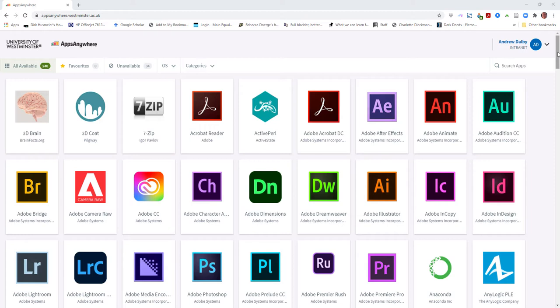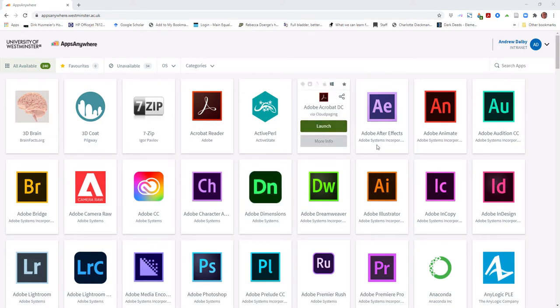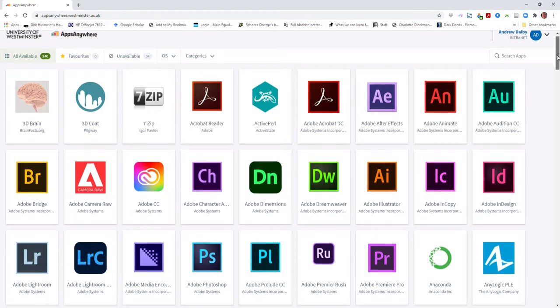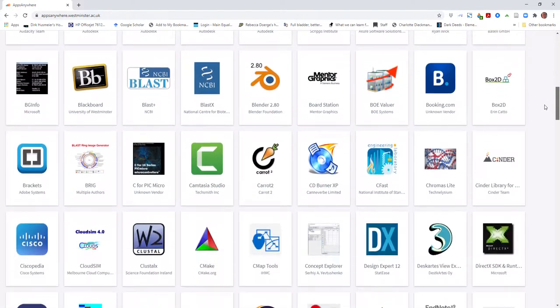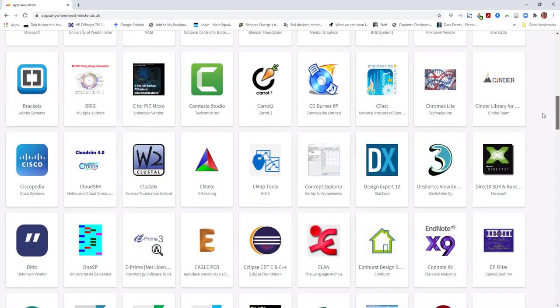Now there's a large amount of available software in Apps Anywhere. You'll see that Clustal X is one of the available programs. This is the version of Clustal between Clustal W and Clustal Omega. You can use it, but it is outdated.